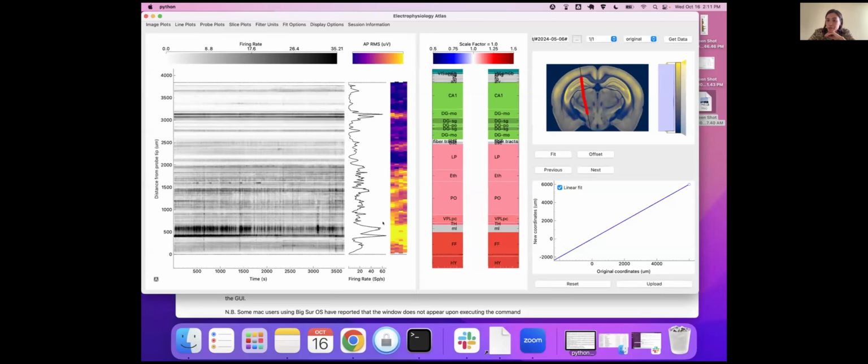I just thought I'd go through the assignment and how I would go about aligning this example and walk you through my thought process, how I go about doing it, and maybe also introduce you to a few different features in the app that maybe you haven't come across. But if there are any questions, just ask in the Q&A and I can answer as I go along.